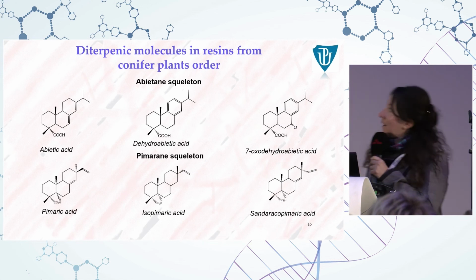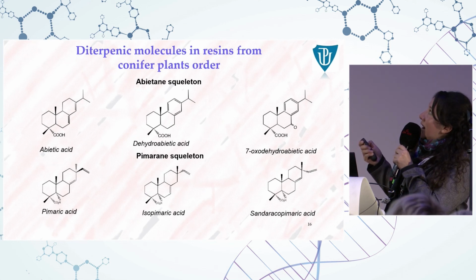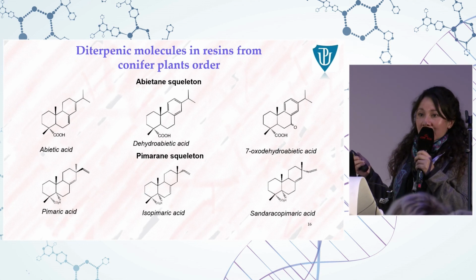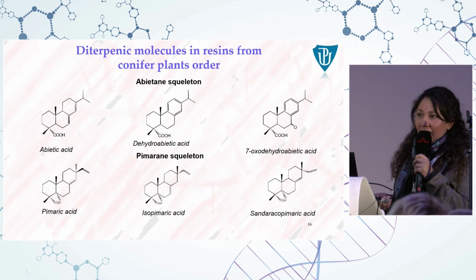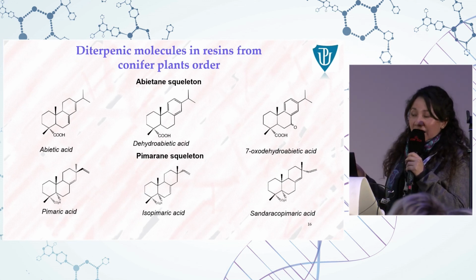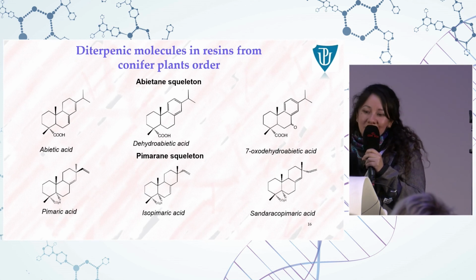Well, when these molecules degrade, this structure tends to aromatize, and then the formation of retene arises, and this can be a marker of either aging or heating. Given the context, thinking that it is a modern paint, from what I'm seeing in the pyrogram, I would tend to say that this painting was prepared by heating.